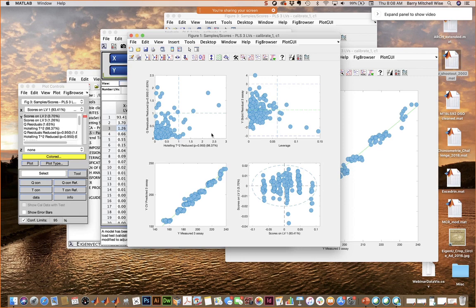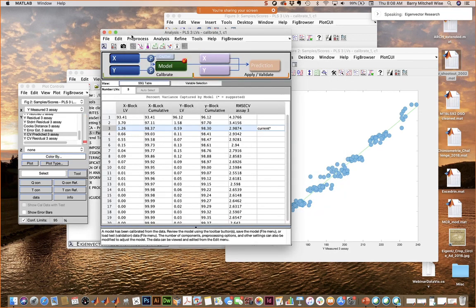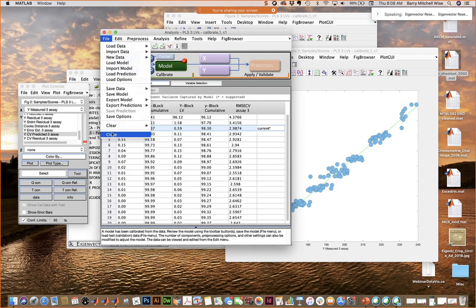Are we talking about rose plots or something like that? Yeah, I think it would be just developing the symbol based on a color by value. We don't have that, but it's an interesting idea.